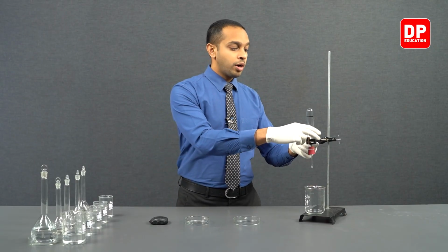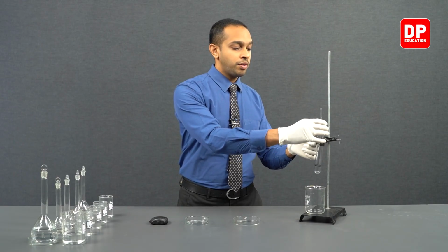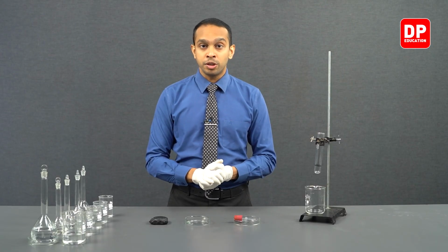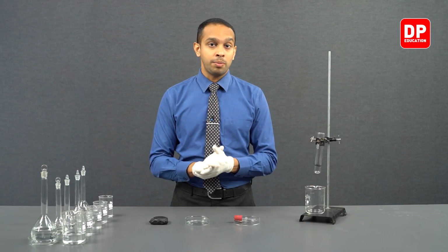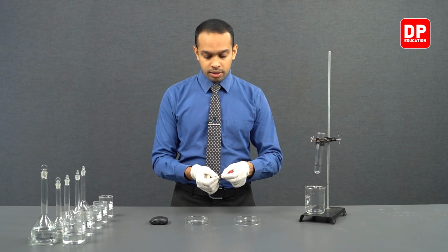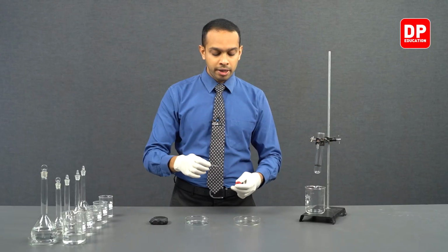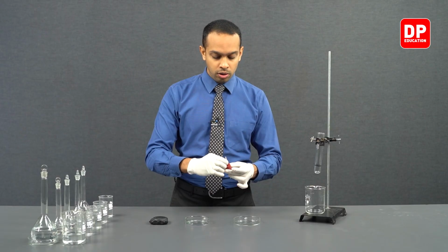So without further ado, now we can move on to the first reaction, where we will be taking 0.2 moles per decimeter cubed HCl and introducing a piece of magnesium into this HCl. And we'll be following the steps that I mentioned earlier. We have a strip of magnesium here. We have sanded it down and prepared it for this experiment, and we are going to place it on this rubber stopper.